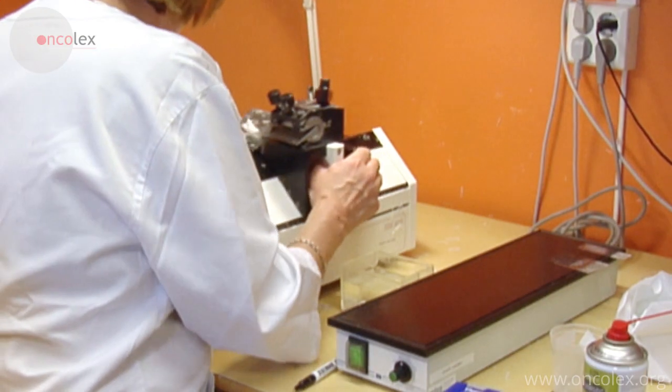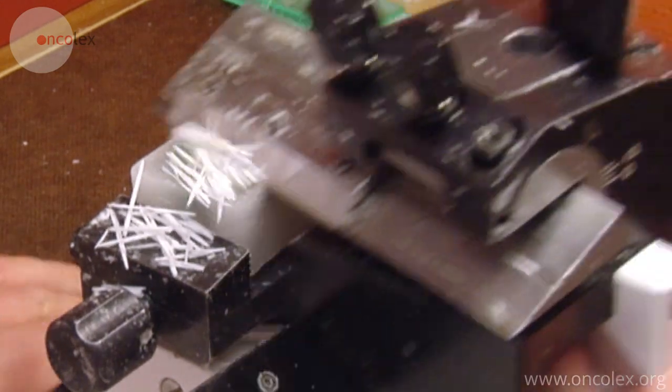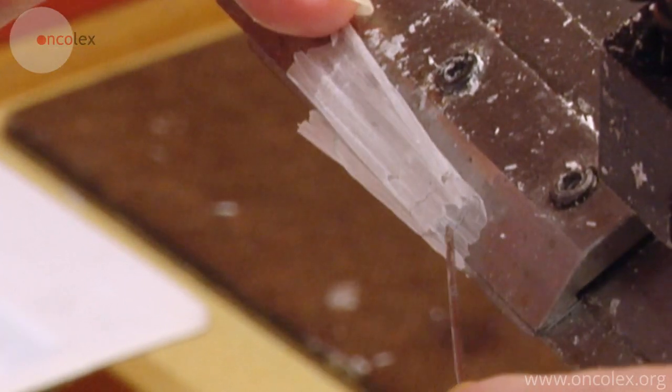The regular slices are cut using an electric rotary microtome, while the large slices have to be cut using a sled microtome. The biomedical engineer cuts off the upper layers of paraffin to get down to the slice, then cuts a one to two micrometer thick section from the slice.